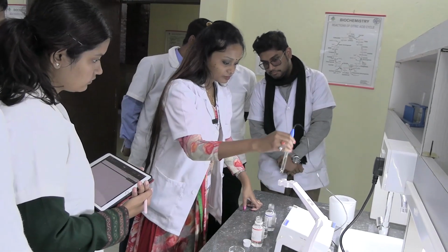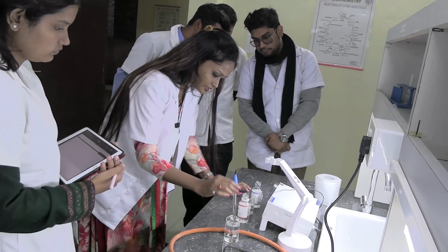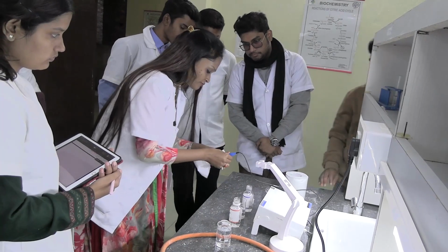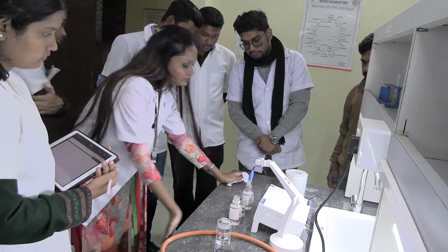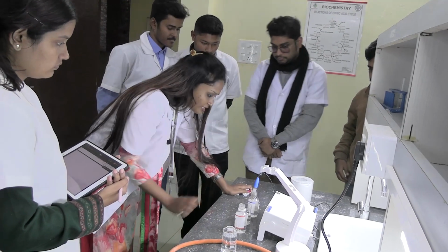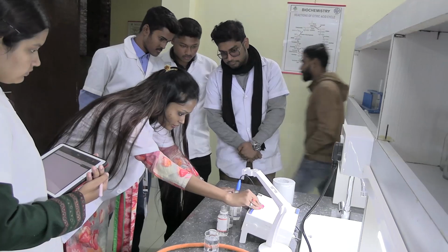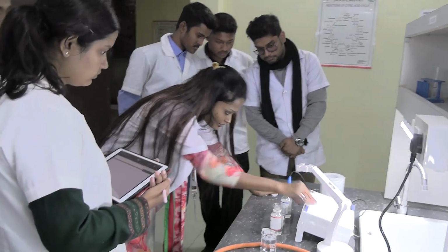First we have to wash the electrode in distilled water. Then dip it in neutral pH 7 buffer. The first button is 7 pH, so first we have to set 7 pH. Now press this switch a little longer and leave it.